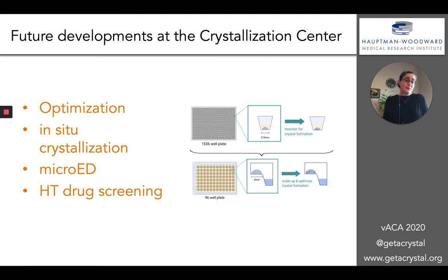We're really excited because we've got a cryo-EM center going in, and it will be opening sometime this year. And our first microscope has a CMOS detector, and we're really uniquely poised to detect the very small crystals that one requires for microcrystal electron diffraction. We're very excited about this. And then eventually we're going to be moving to enabling some high throughput drug screening with these small crystals that we can detect.